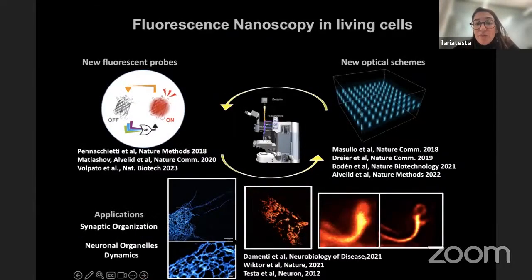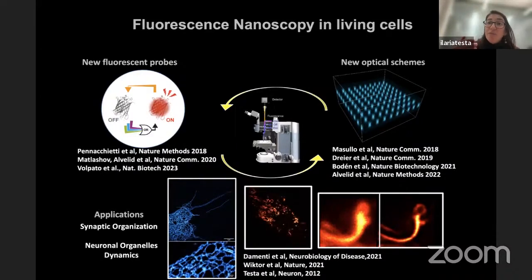All right, so a few words about what we do in the lab. If you want to develop methods in super resolution, sometimes when I say I'm in microscopy, we do optical engineering. And for a long time, that was enough to create a new microscope. But then over the years, what became more and more important is to think about the probe. So now this is part of your microscope. How you decide to label your sample, but not only the labeling, actually how the physical chemistry of the probe behaves.